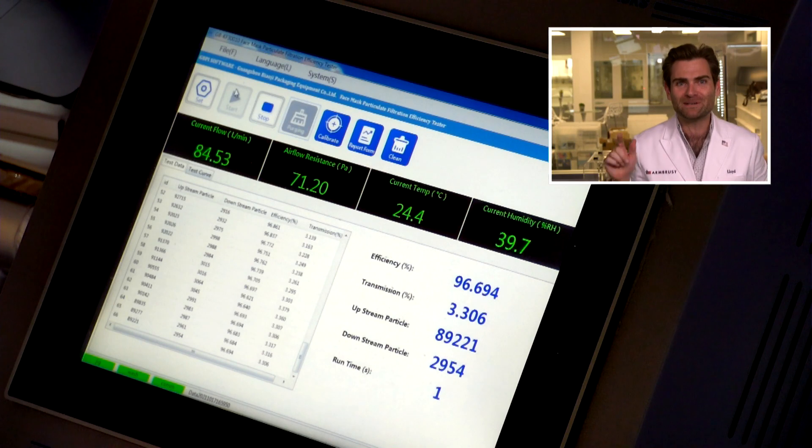This is a PFE machine — particulate filtration efficiency machine. I'm doing the ASTM test. It's the American standard test for face masks.